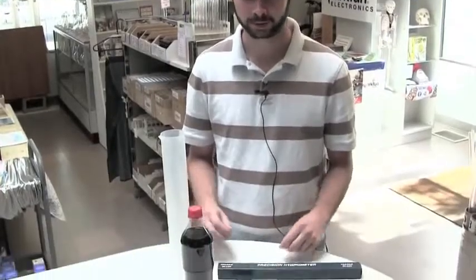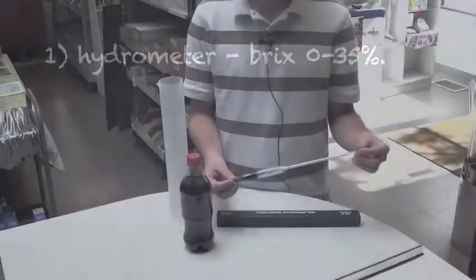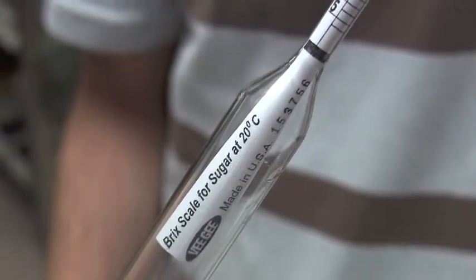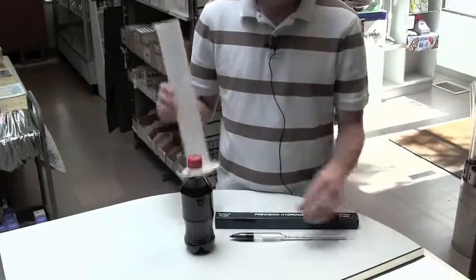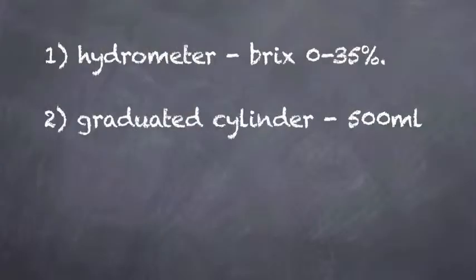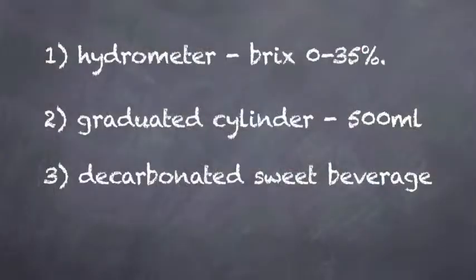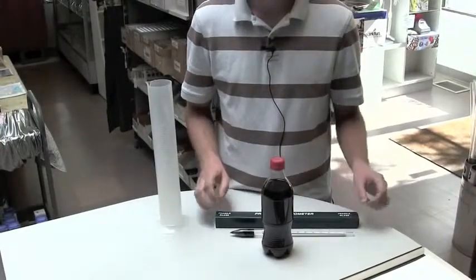For this project you'll need a couple things. First, you'll need a hydrometer that measures in brix with a scale of 0 to 35 percent. These hydrometers are calibrated to work best with a liquid temperature of about 68 degrees Fahrenheit. Next, you'll need a graduated cylinder about 500 milliliters big, and finally you'll need a decarbonated beverage. You want to let the carbonation out of your beverage before you do this because it might disrupt the accurate measurement of the hydrometer.